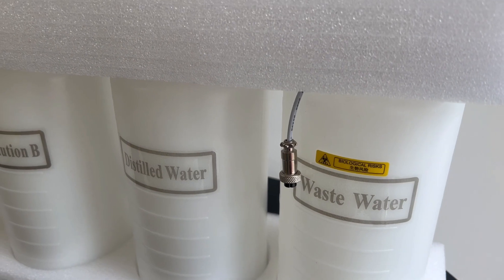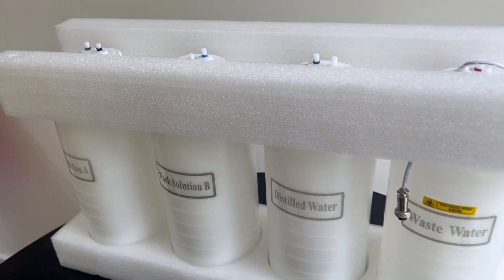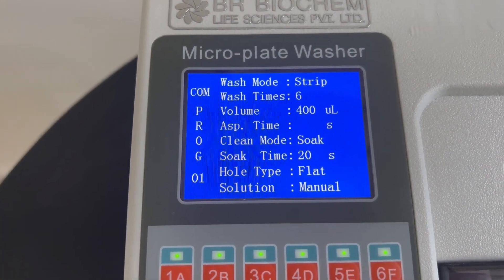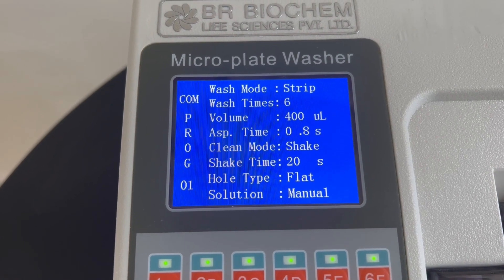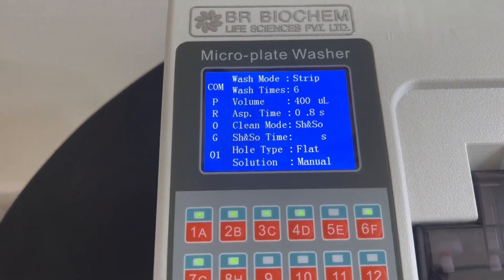Dispensing volume: customize the dispensing volume from 50 to 950 µL with a 50 µL adjustable interval. For extended capabilities, the volume can be expanded to 0 to 6,000 µL with a 25 µL interval. Soaking and shaking time: adjust from 0 to 999 seconds, minutes, or hours according to your protocols.